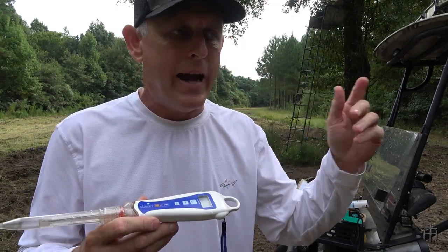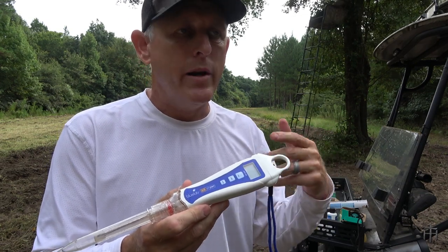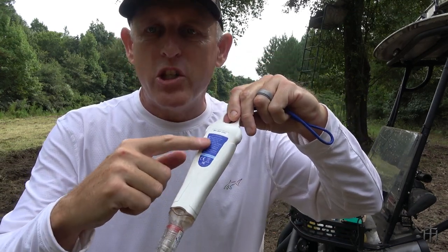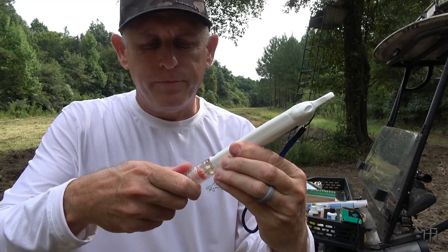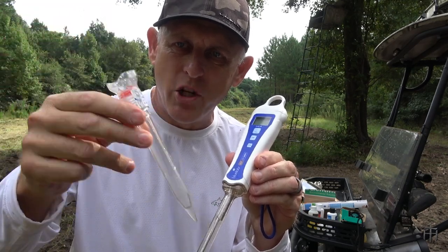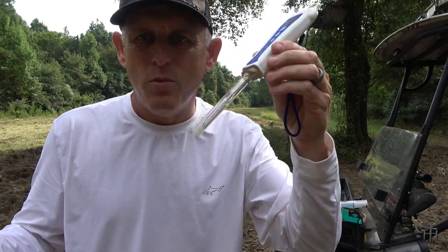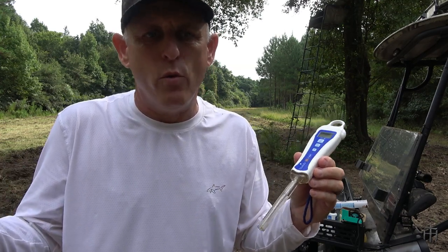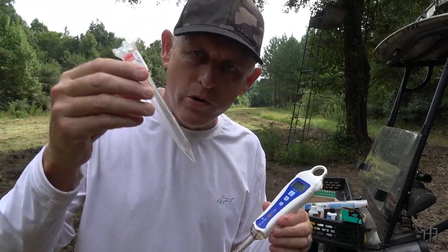I've already calibrated it so we can do a few soil samples right now, but at the end I'll show you how to calibrate it — it's pretty simple. The calibration instructions are stuck right on the back so you can always flip it over and reference them. You screw off this cap, which is used to make a tunnel in harder dirt before inserting the pen. When my soil is this soft I don't need it — I just stick the pen in to about three or four inches deep and get a good reading.